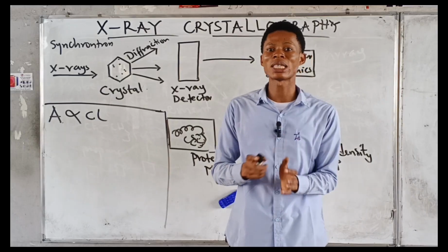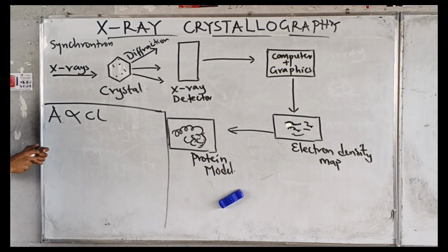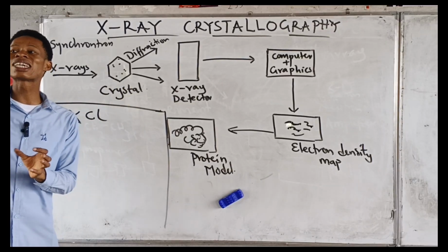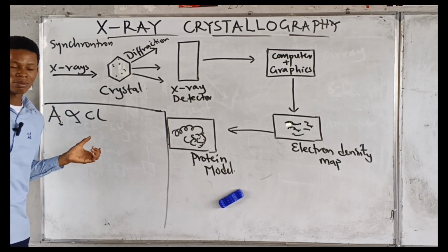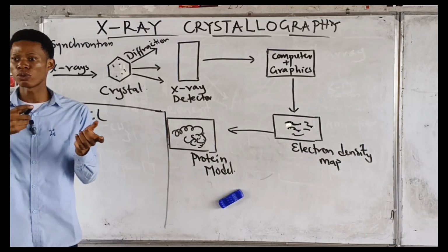So when you put the two of them together, you have the Beer-Lambert law. And putting the two together, I want to relate it to crystallography. It says that the absorbance of the light absorbing material is directly proportional to the concentration of the solute in that light absorbing material. If it is X-ray crystallography, now we look at the crystal. So the absorbance is directly proportional to the concentration of the crystal, and also the path length the light travels.